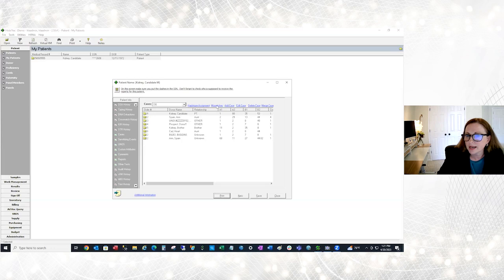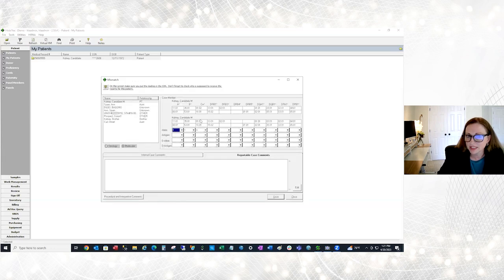We also have ways to assign mismatches. So within my case, I'm able to assign mismatches. If I go to my donor, my aunt here, this again is displaying the typing for the patient. This is the typing for the donor. I have the ability in these 4 fields to assign mismatches on an allele or antigen level. This is a drop down, so if you needed to change the values or streamline them, you could.